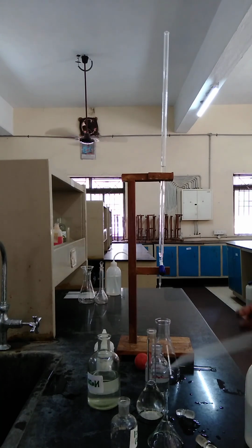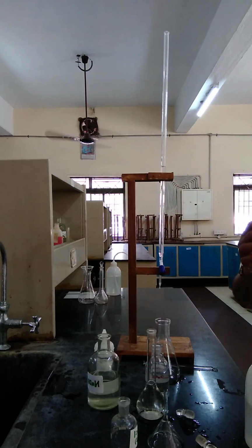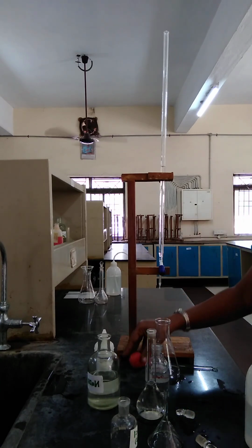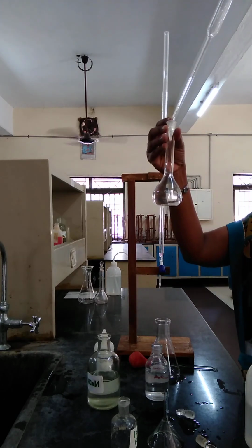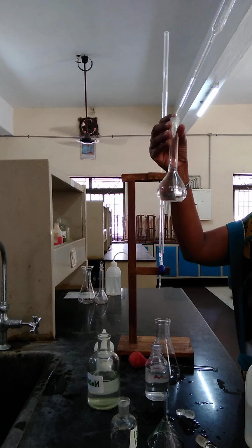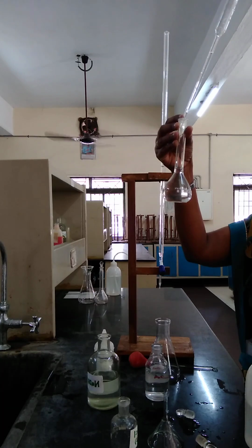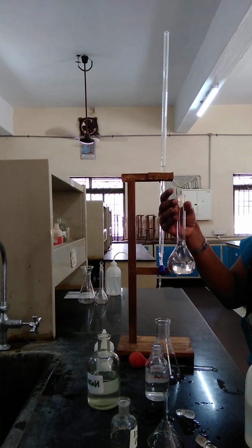Now you can take the distilled water in the flask, then go dropwise to make up until the mark. If you add excess water, it may lead to dilution of the HCl. That also gives the wrong answer. So diluting the sample may give the wrong answer.